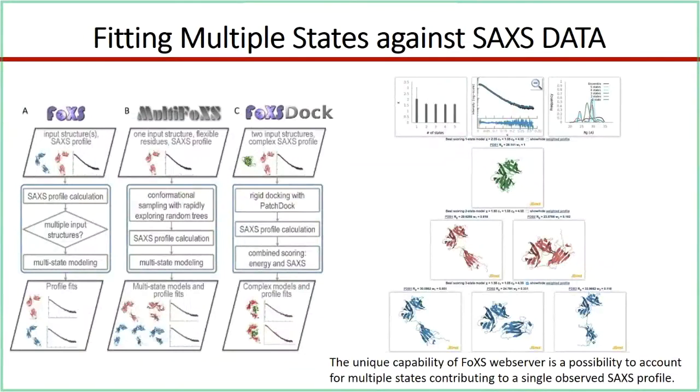So one very important distance constraint in SASREF, which I forgot to mention, is if you are modeling a large multi-domain protein, and you have continuous structural information, and if you are splitting the multiple domains into separate PDBs, you have to give a contact file where you say that the C-terminus of domain 1 is 4 angstroms from the N-terminus of the next domain, domain 2.